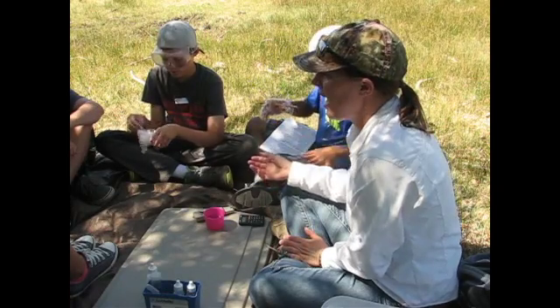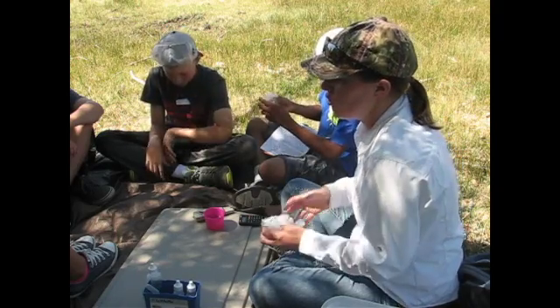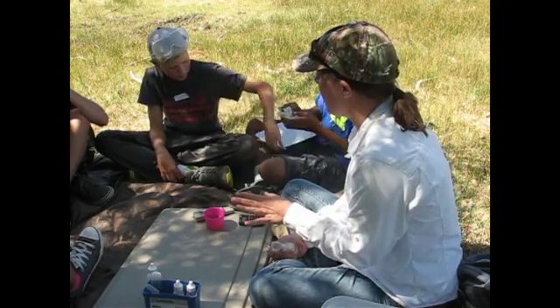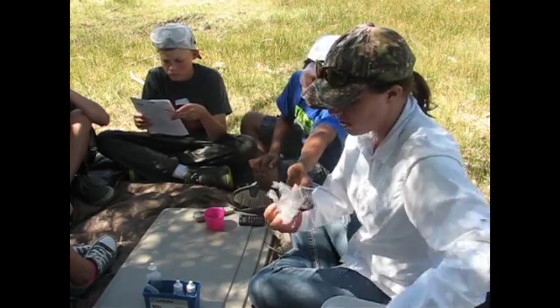So 2 drops doesn't actually tell you how much in parts per million. To get parts per million, you take however many number of drops you had, and you multiply it by 10. So is it 20? It's 20. So we had 20 parts per million.